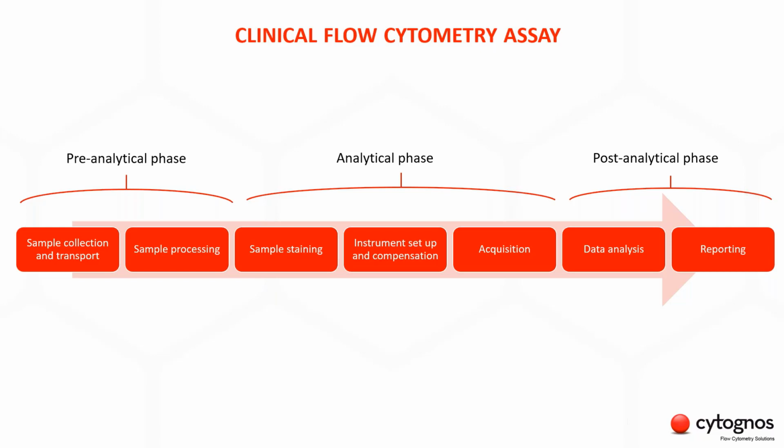So there are multiple checkpoints here where different errors might be currently introduced and ignored, especially in the pre-analytical and post-analytical phase. And these errors have economical consequences and negative effects in the patient care, right? So that's why all flow cytometry assays require careful assay design, instrument setup, performance validation, and ongoing quality monitoring.